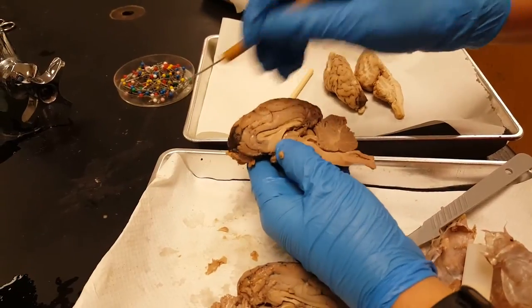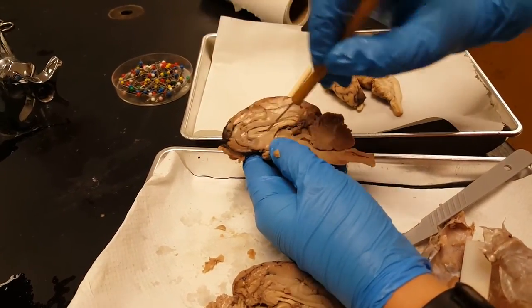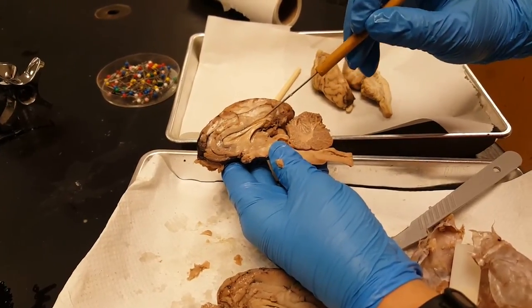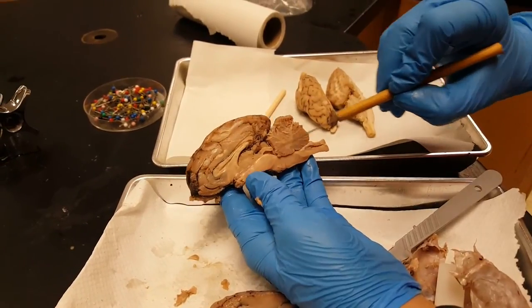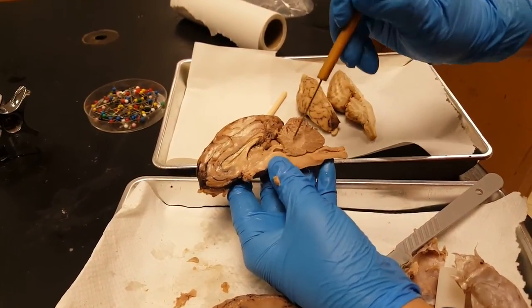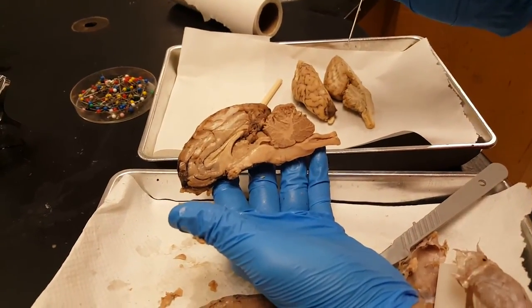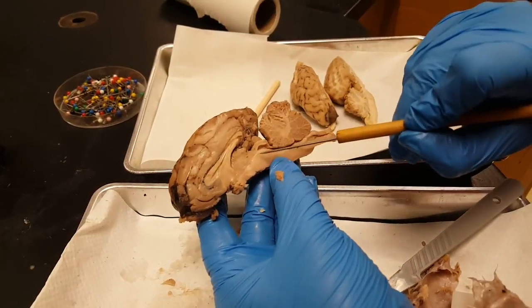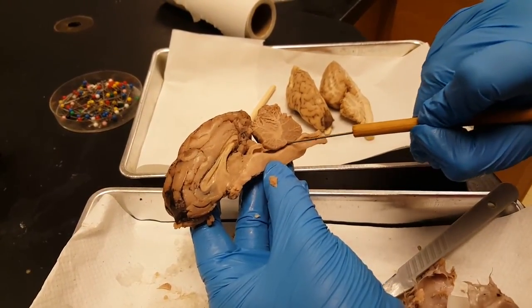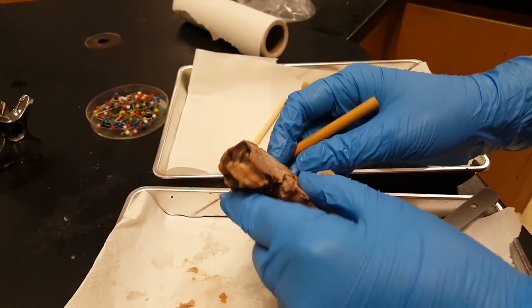Corpus callosum, lateral ventricle, fornix, third ventricle. Back here is your cerebellum, and when you cut it nicely you can see the little white matter there, which is known as the arbor vitae. And then the fourth ventricle is actually underneath it. I think that covers it.